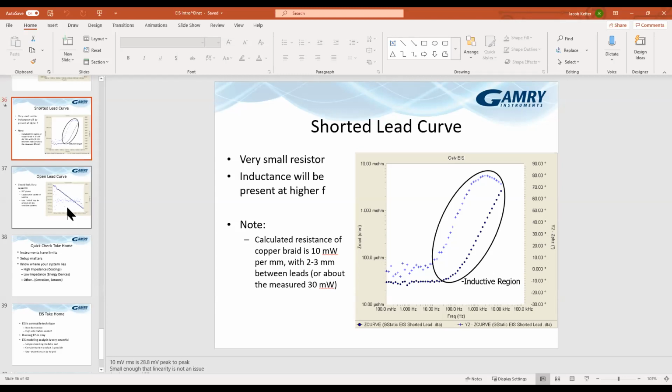So that's one side of things. The other is where your 0 point is. For a galvanostatic EIS experiment, your DC background is 0 current. So if you have system drift, it does drift. The voltage in your background is changing versus time in that case.